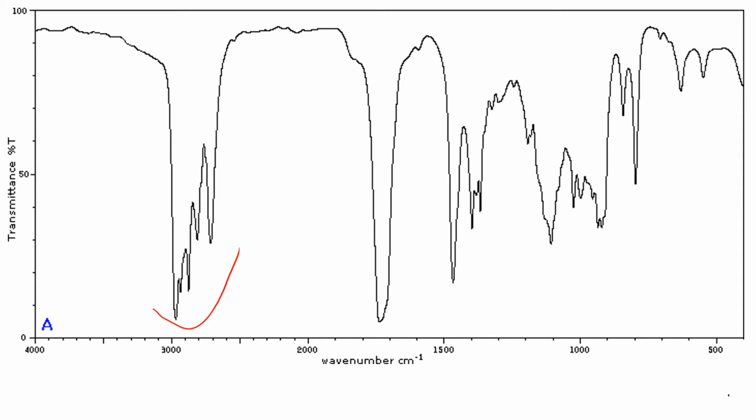We call it a peak even though it's pointing down, just for clarity of language along with the mass spectroscopy. So these are peaks even though they are pointing downwards. This peak here looks like it's between around 3,000 and somewhere in the upper 2,000, so like 2,800 or so. If we look at the resource sheet you've been given and look for those numbers in the range, you can see that alkane bonds, that is C to H bonds, should have a medium to strong peak with a couple of subpeaks in the 2850 to 3000 range. So this tells us that there are C to H bonds present in our sample.